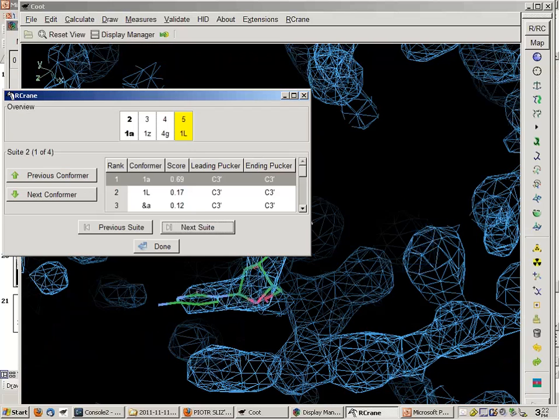My weight on density is very, very slight, and the main difference over just doing a standard Coot real space refinement is that I'm imposing the torsions from the predicted conformers, fairly tight torsion constraints, and also very, very strict restraints to try to keep the sugars puckered appropriately. So I'm building in either a standard C3' or standard C2' endo sugar pucker, and making sure that those don't get flattened or distorted during the minimization. The sugar ring torsions are very, very tightly constrained.